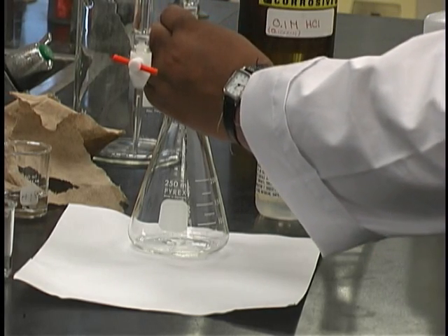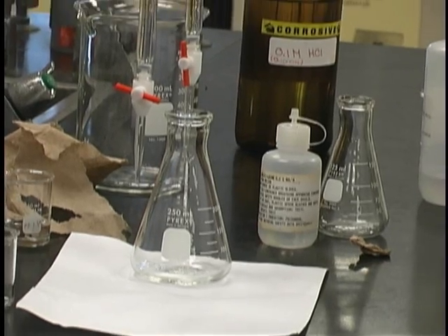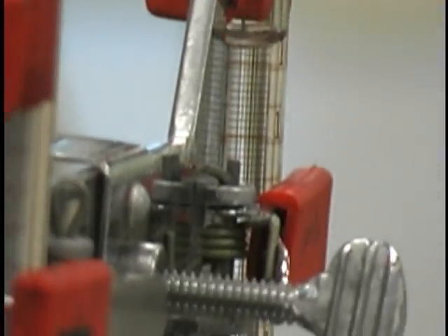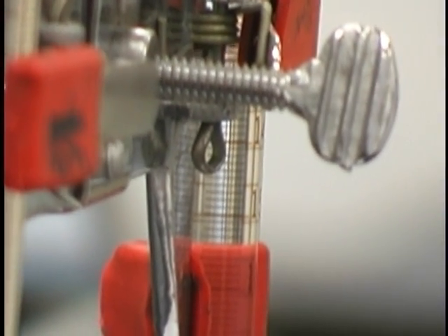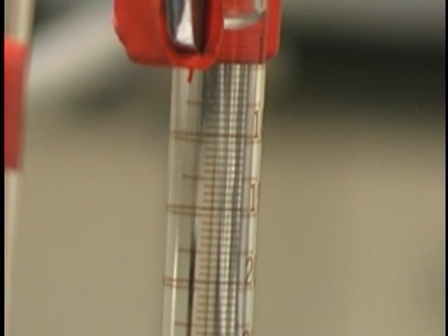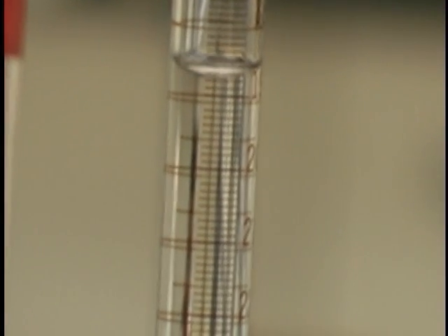It's also important to remember that the burette can be read to two digits after the decimal place. At any time, you can adjust the height of either the burette individually or the entire apparatus. It is advised to do multiple trials for every part of this experiment — three trials minimum are advised, and it is a good idea to use different volumes of acid in each trial.